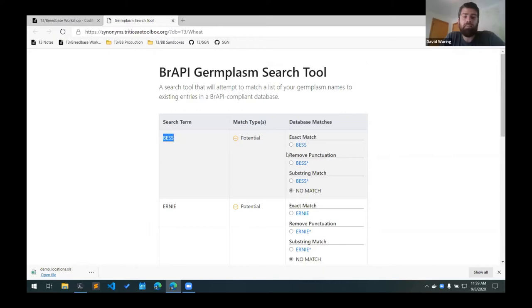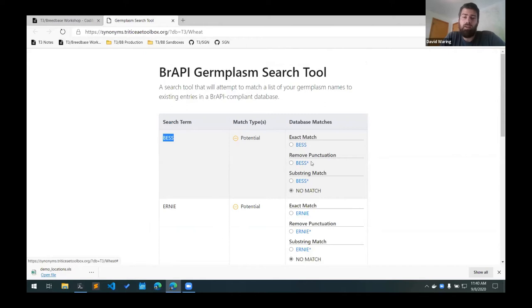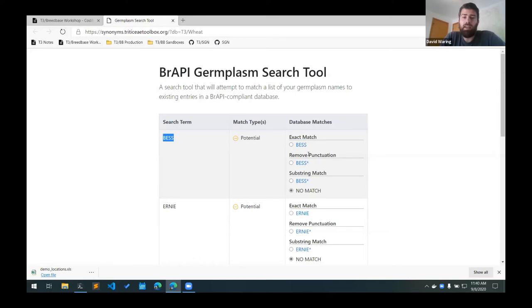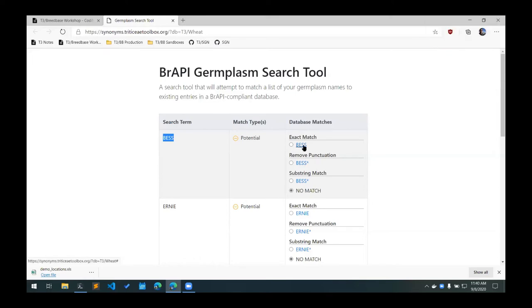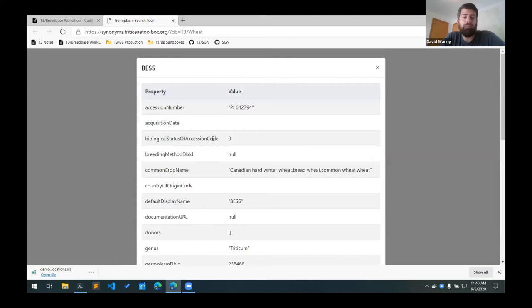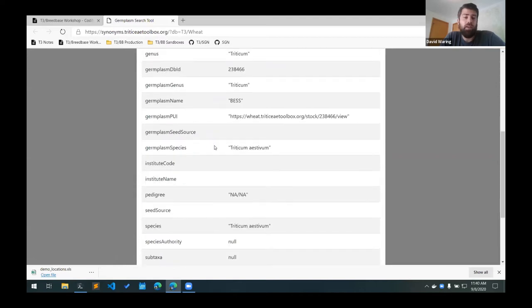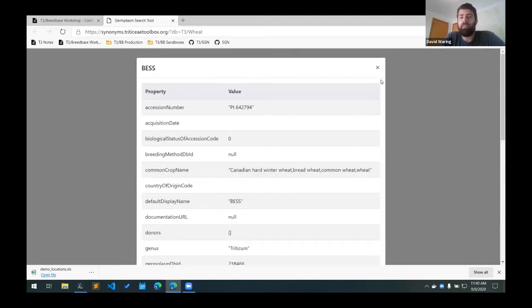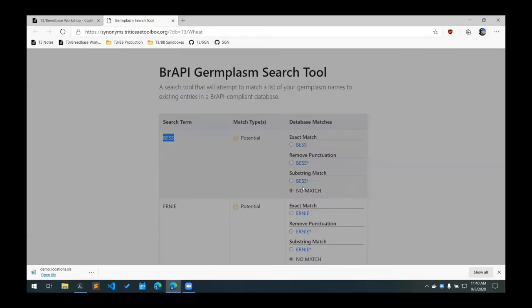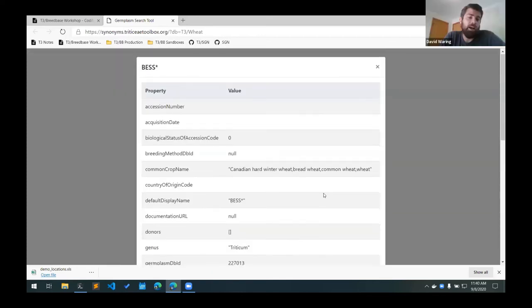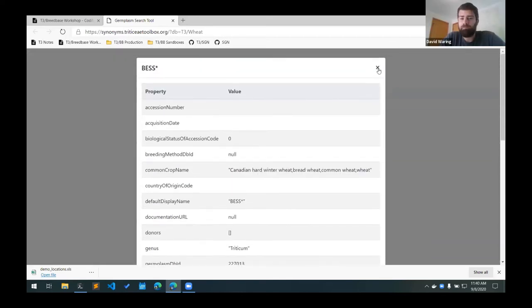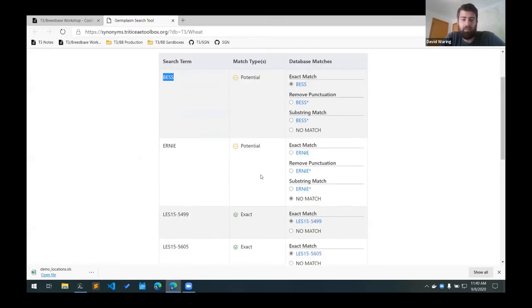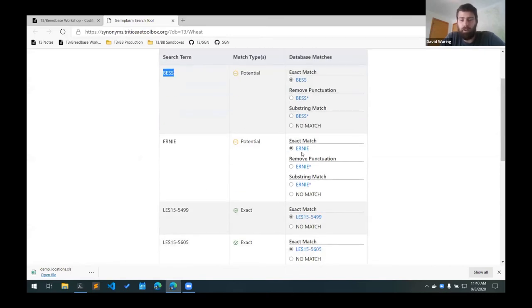And then we'll search and it finds some potential matches. For Best, we found an exact match called Best. And then there's also another line that it found with these two search routines, it found Best Star. If you want to find more information about these database records, you can click the database name and it'll bring up more information about the germplasm record that we have in the database. So you can inspect the database records and decide which one of these is a match. For this case, we're going to match Best to Best and Ernie to Ernie and not the star variations.